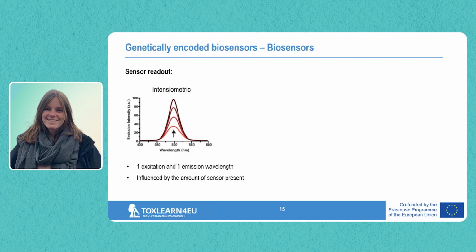And for example, if you have more hydrogen peroxide, your peak will move upwards. So you have a higher signal. The problem with this is that your signal, as we want, will be affected by the concentration of hydrogen peroxide, but it will also be affected, for example, by stress factors. So I worked in my postdoc with heat stress.